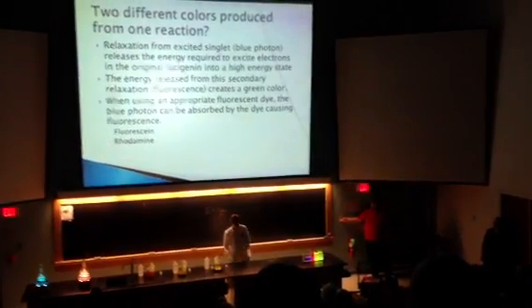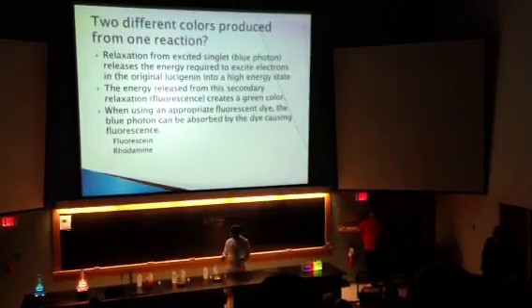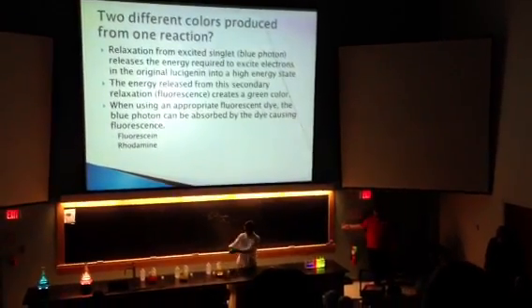And that is the fluorescence over here, and that is chemiluminescence with fluorescence in this one, and all of them actually as well.